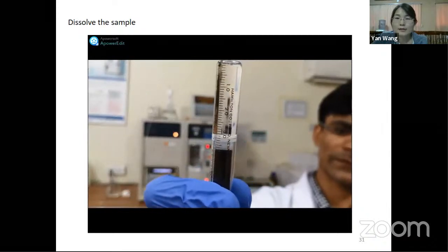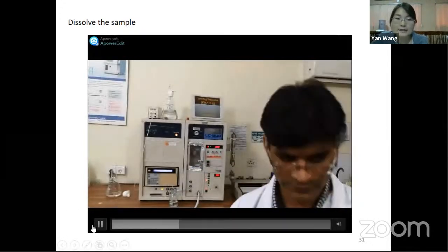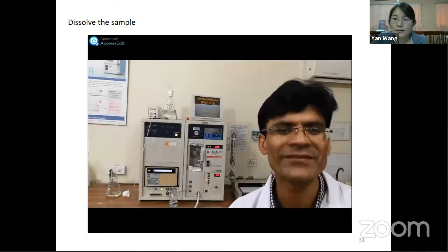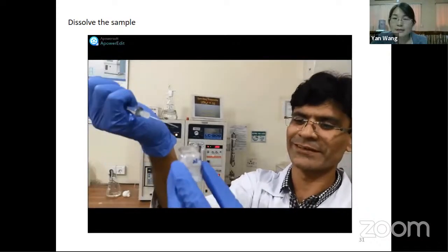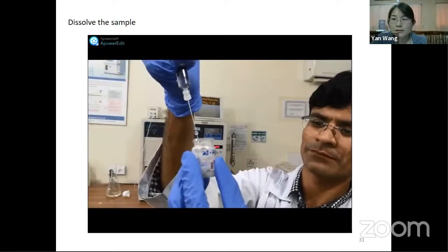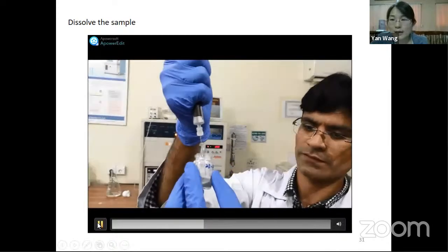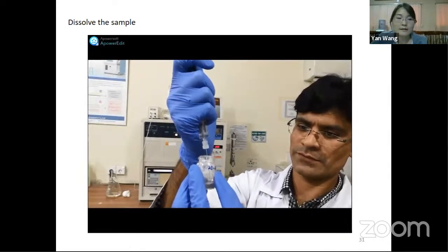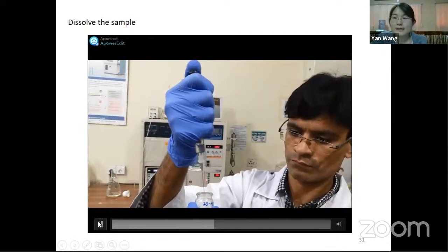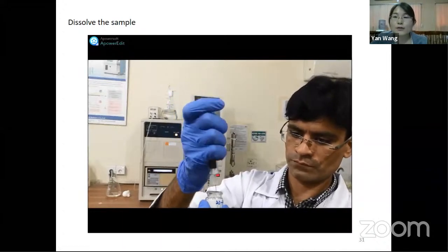If the quantity of the sample is acceptable for one injection, then you should use the volume of the loop. If you have a 3 ml loop, then you use 3 ml to dissolve your sample. This is the best option. If the quantity is a little bit too much and you have to inject two times, then you can use double the volume to dissolve, and inject two times. You need to have a clear idea about the volume.